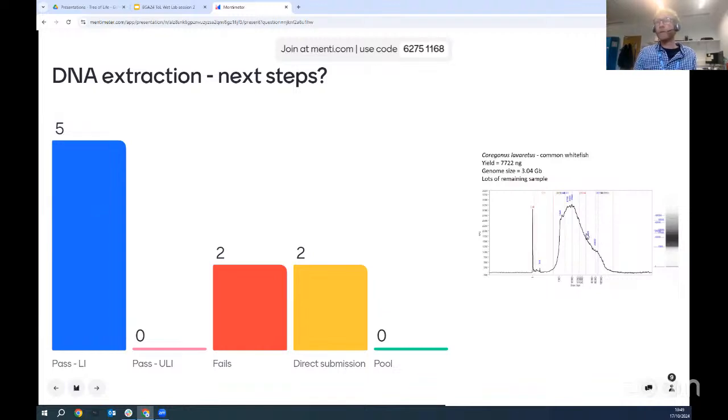So we see we have sufficient DNA, 17 kb and above. So we definitely proceed with our low input DNA fragmentation for this sample. Yeah, it's good yield. Most of the smaller stuff will be lost during the process, but we'd still be left with sufficient DNA to put forward for a PacBio standard library prep.